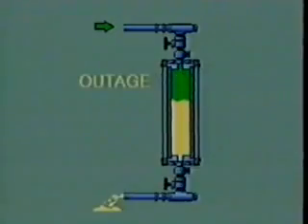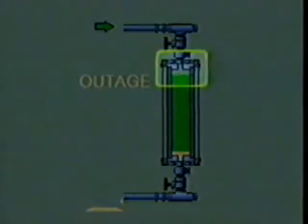Expansion occurs as the ambient temperature of the sample increases. Problems due to expansion usually occur with NGL samples. This can be a safety hazard if the sample has no room to expand within the sample cylinder. The end result could be a ruptured cylinder which could explode like a bomb. To allow for expansion, outage is usually needed for NGL samples. Outage simply refers to creating a space within the sample cylinder by bleeding off displacement fluid.